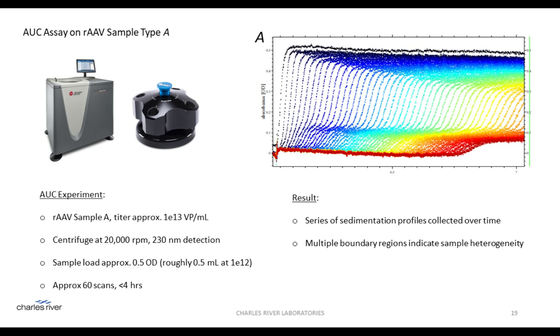But folks, here's what a real AUC experimental setup and result looks like. I should note that these data and all results I'll show hereafter derive from R&D model AUC samples. These are not data from clinical samples nor drug products, but are instead simple R&D model samples that nevertheless are a good representation of AAV behavior.